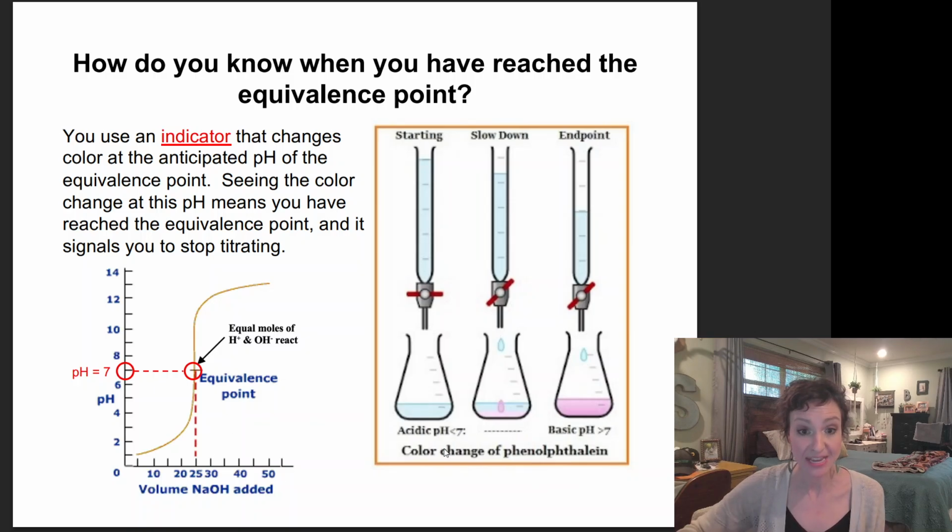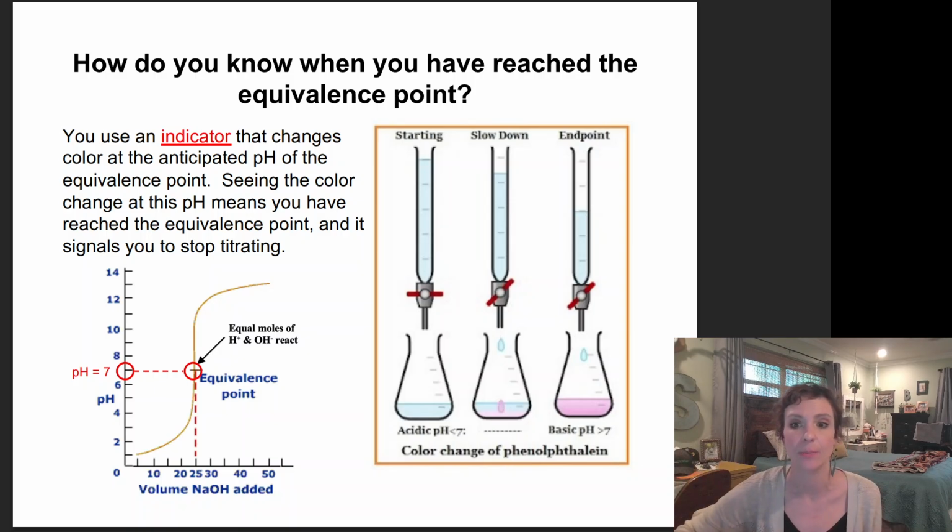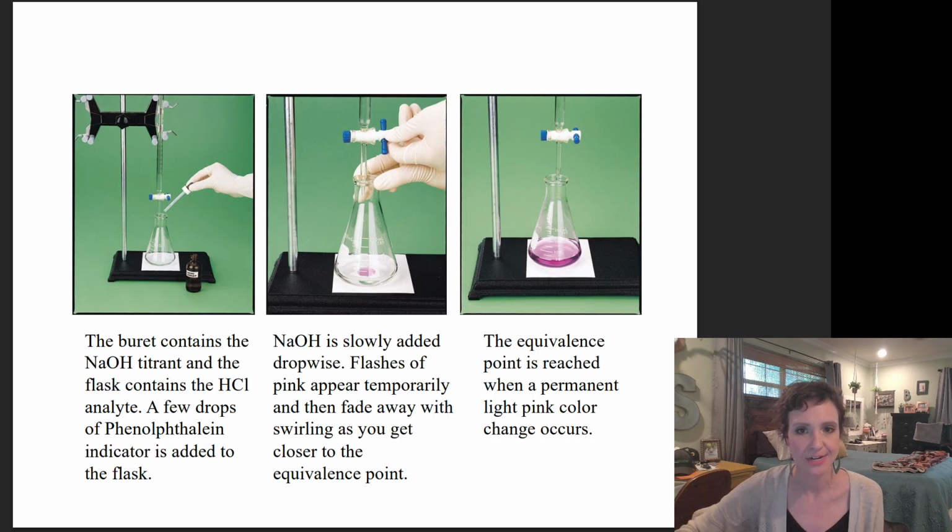Well, here phenolphthalein is a very common indicator when you do a titration of a strong acid with a strong base, because that strong acid is going to be clear in phenolphthalein when the pH is less than 7, but as I add base to it, it is a clear switch that has turned off, that the second it turns basic, it will give you a bright pink color, okay, you guys? So like, not in a cartoon version, this is what this is going to look like.